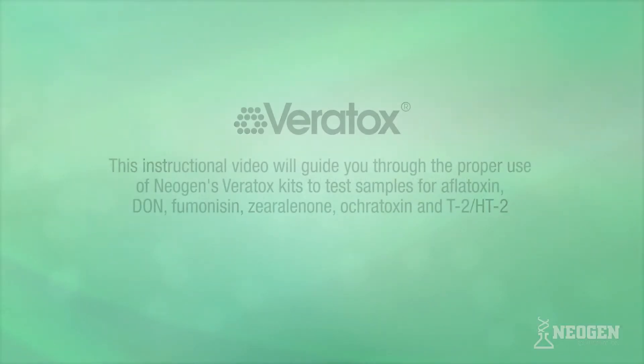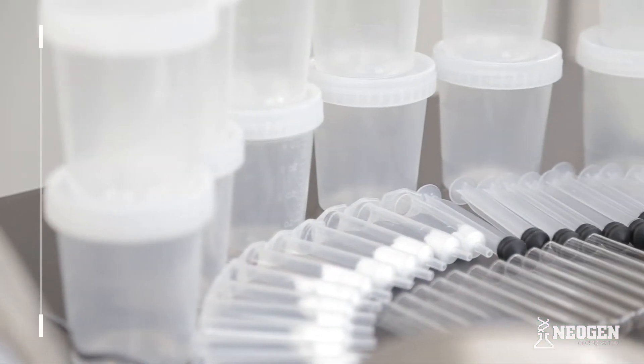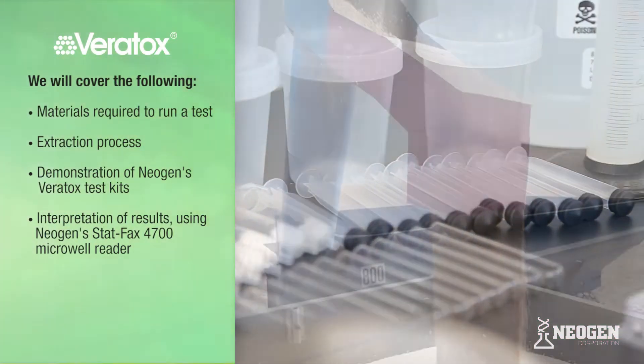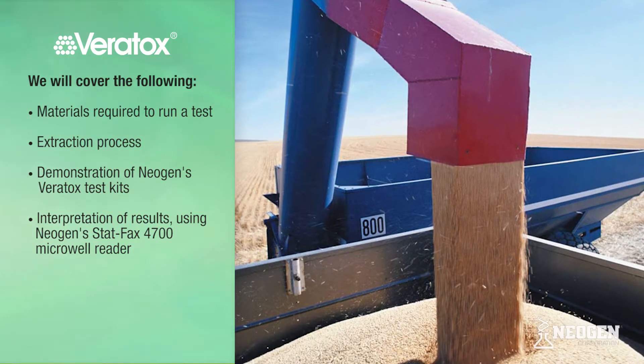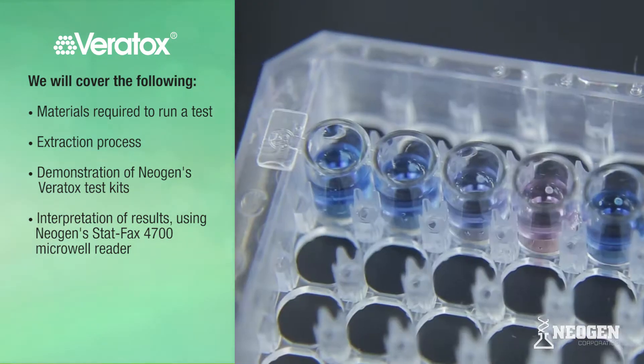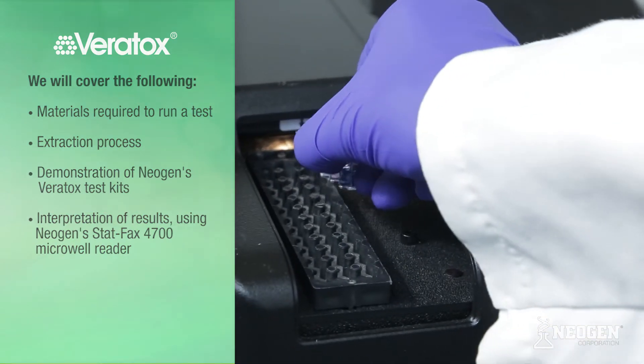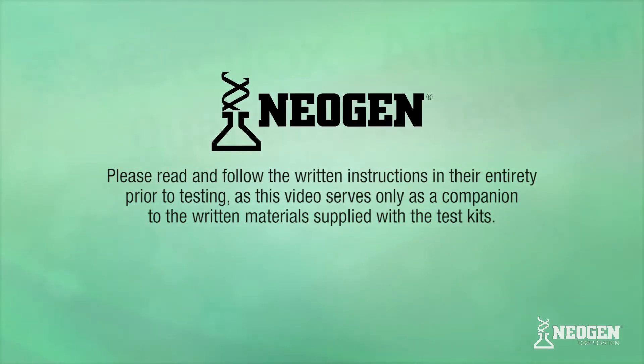This instructional video will guide you through the proper use of Neogen's Veritox test kits to test samples for Aflatoxin, DON, Fumonacin, Zearalenone, Ocratoxin, and T2/HT2. We will cover the materials required to run a test, the extraction process, a demonstration of Neogen's Veritox Aflatoxin test kit, and an interpretation of results with Neogen's StatFax 4700 Microwell Reader. Please read and follow the written instructions in their entirety prior to testing, as this video serves only as a companion to the written materials supplied with the test kits.